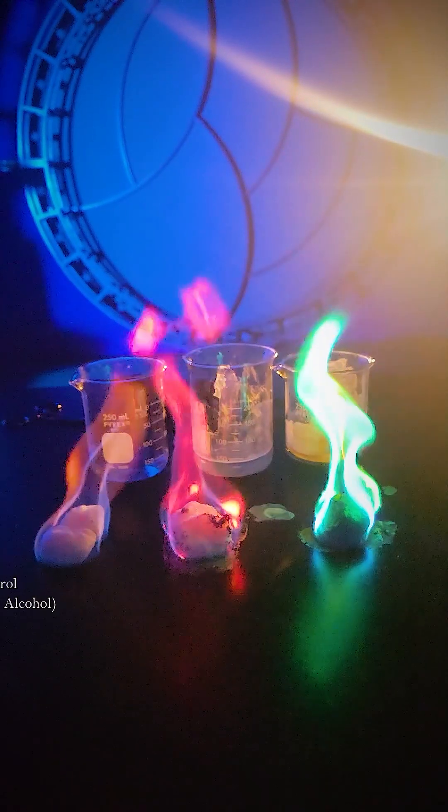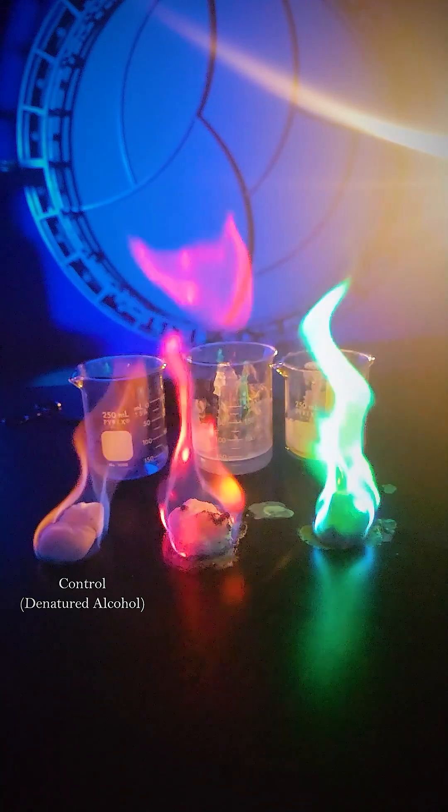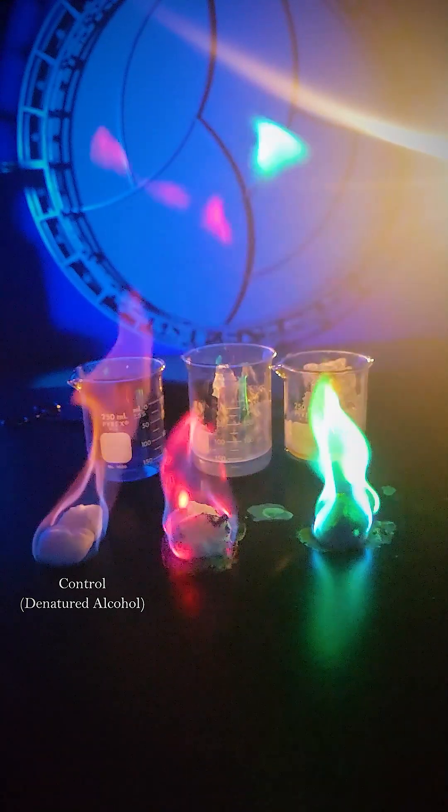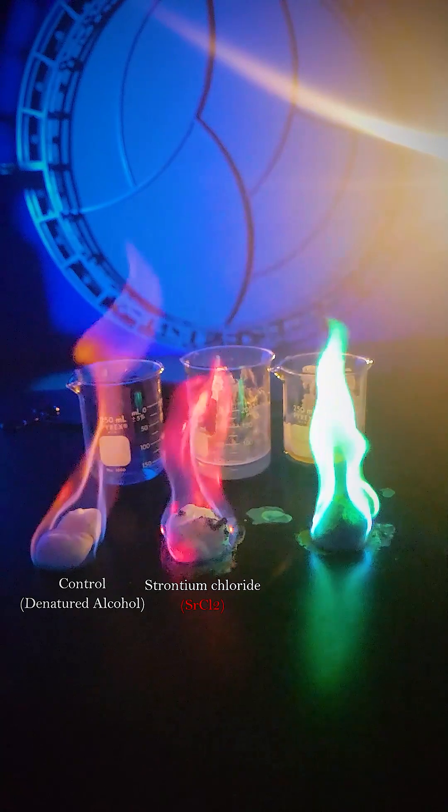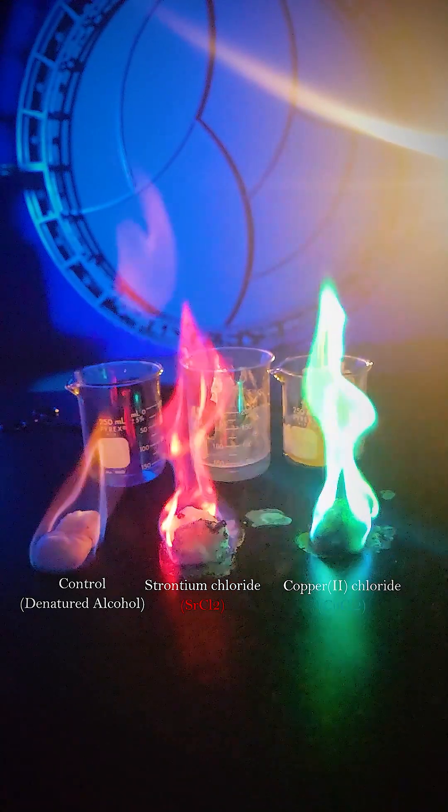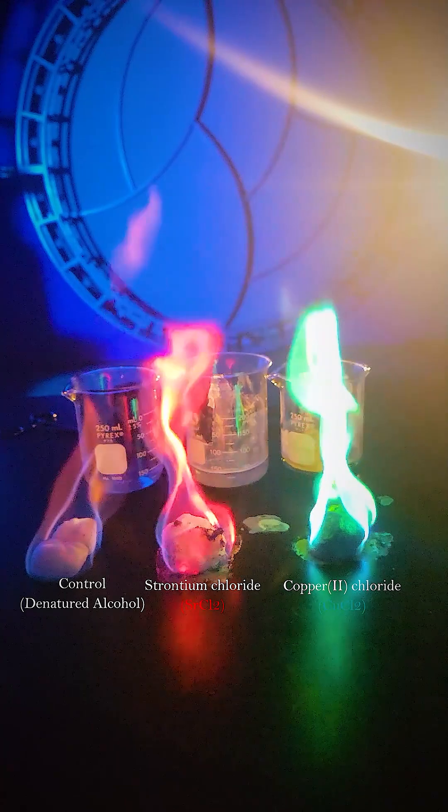So our control here burns a much more traditional blue, almost orange color - traditional for most fires. But as you can see with our strontium chloride and our copper 2 chloride, they're very drastically different. One being very bright red, one being a very vibrant green.